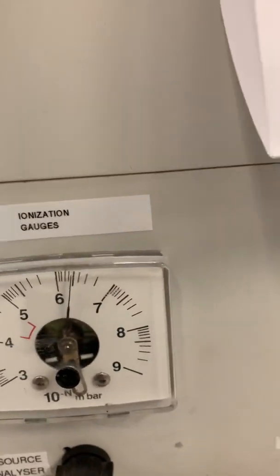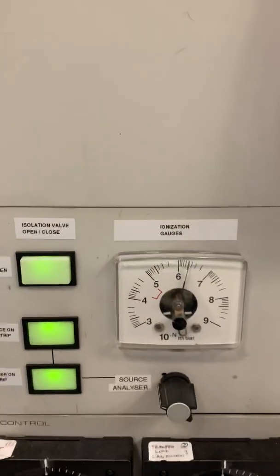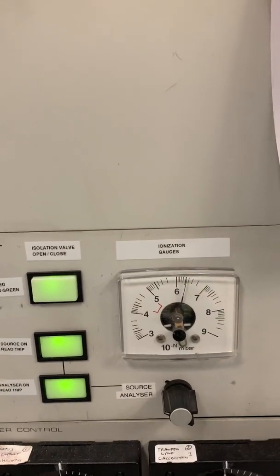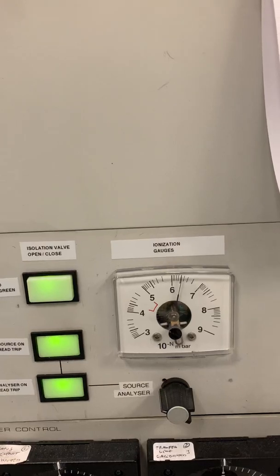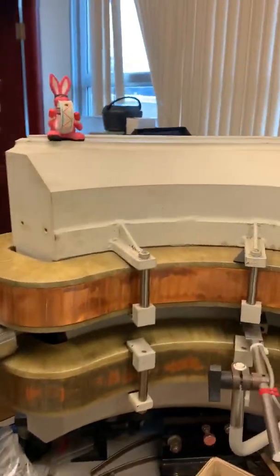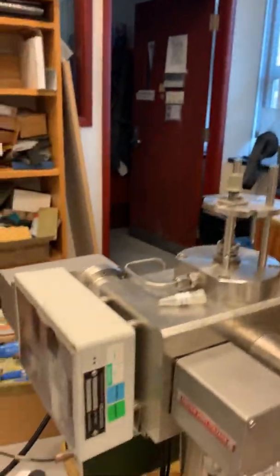Okay, so we need to be able to locate where the gauges are on our instrument and then be able to read them to know that it's okay to go ahead with the experiment. So this particular instrument has a source region followed by the magnetic sector, followed by the detector here.